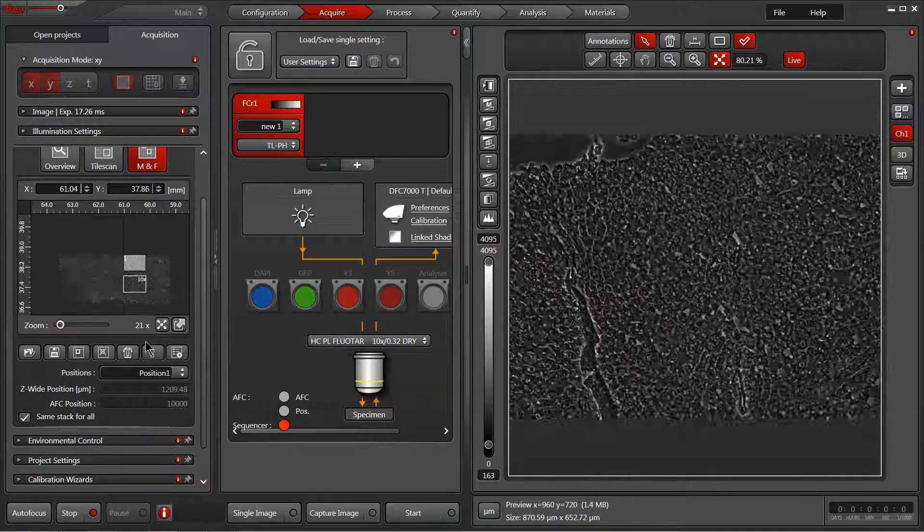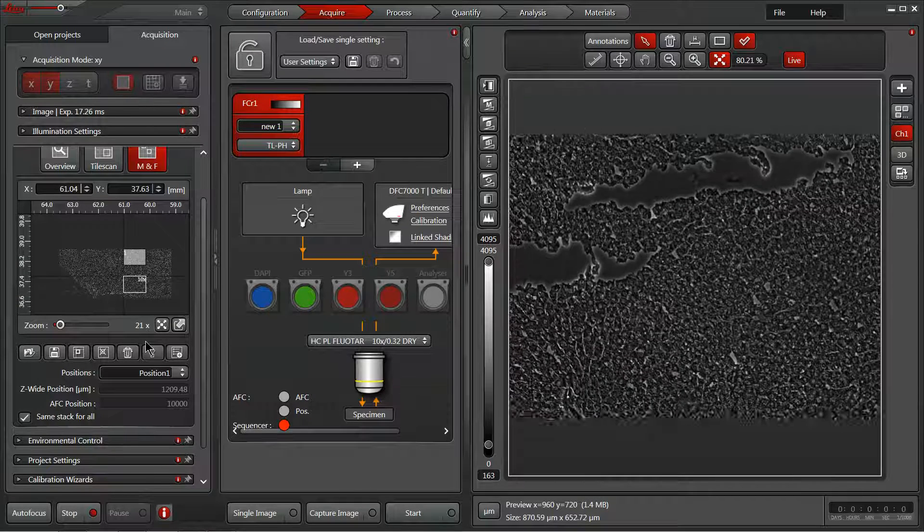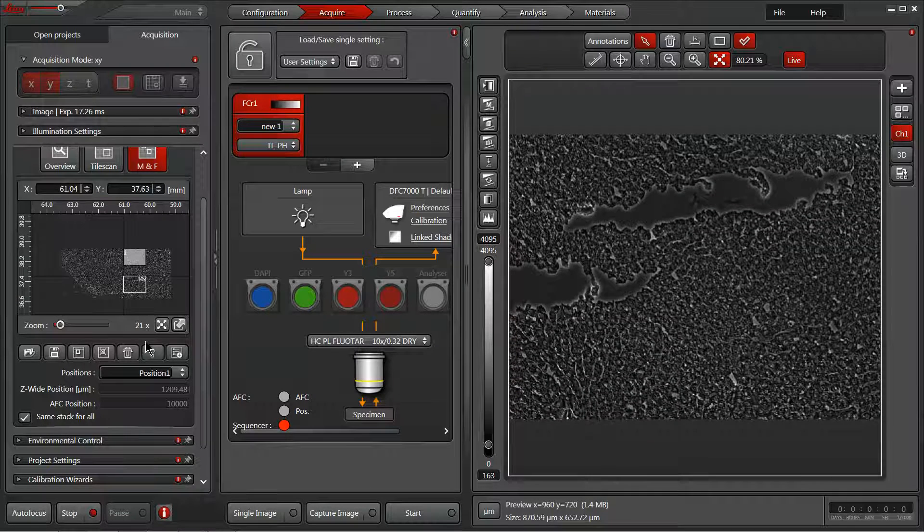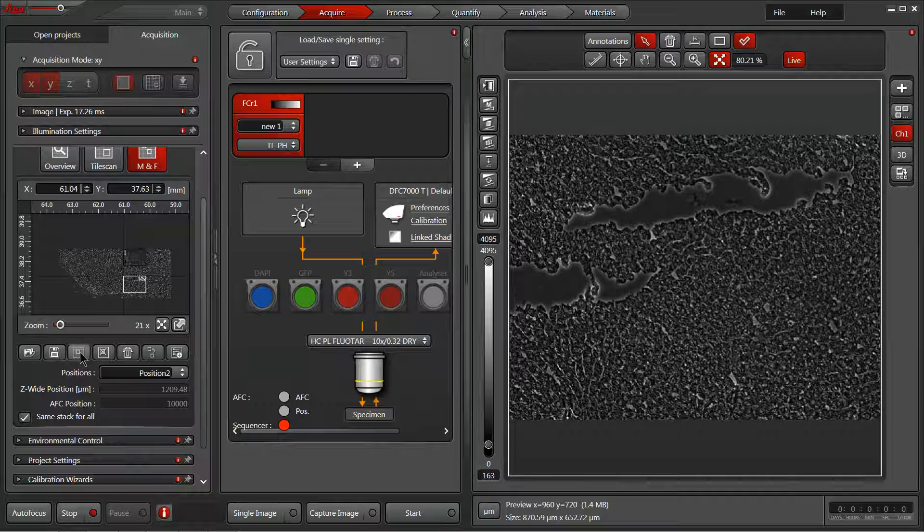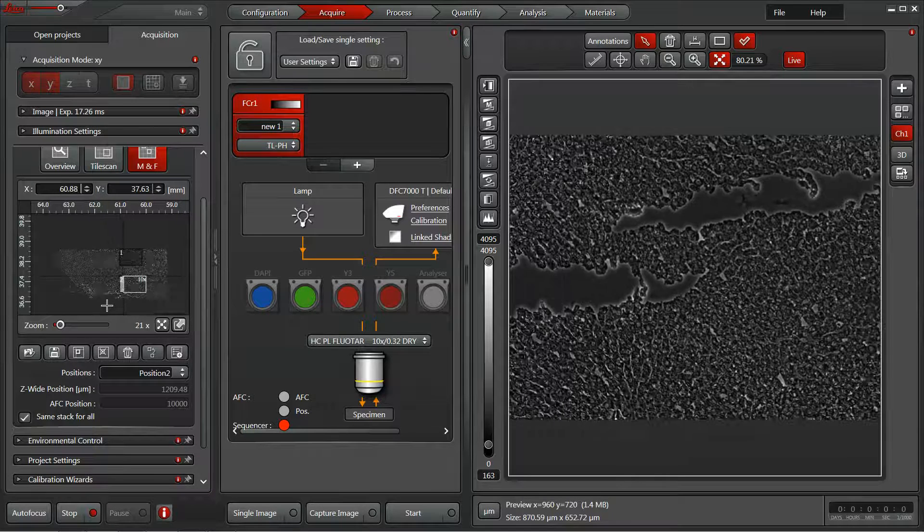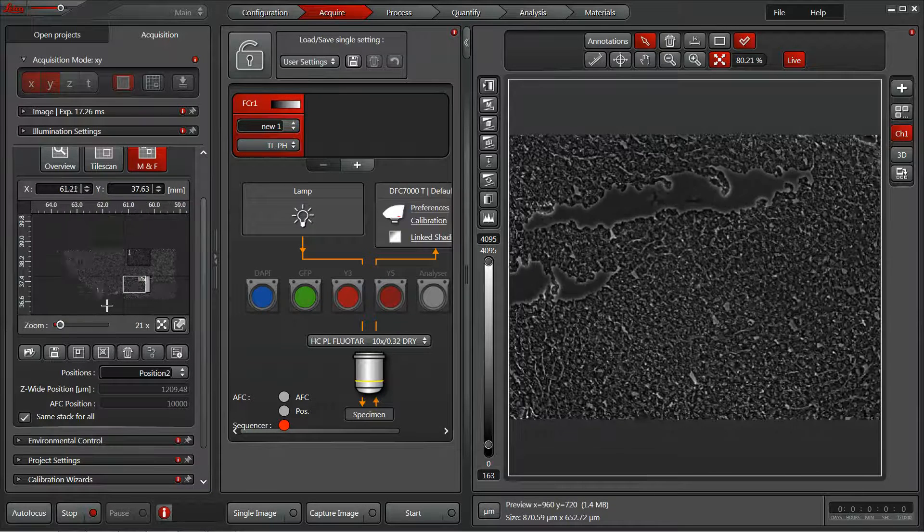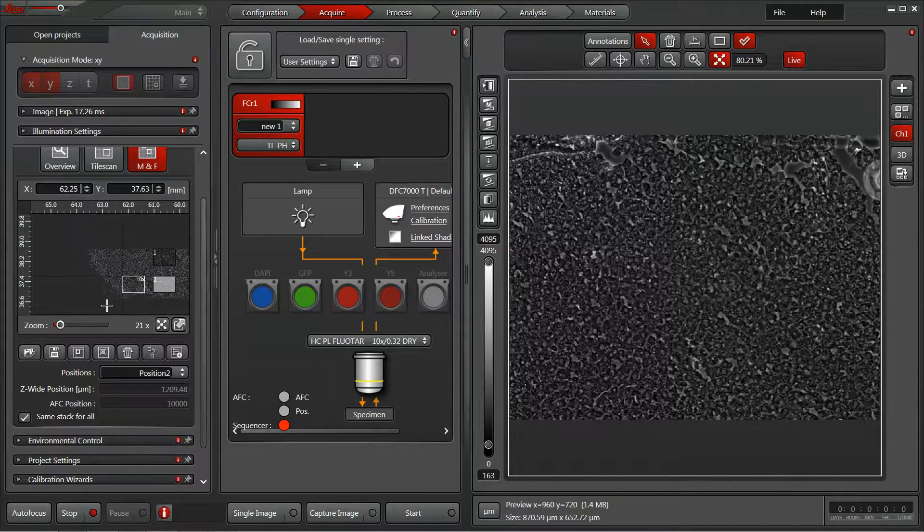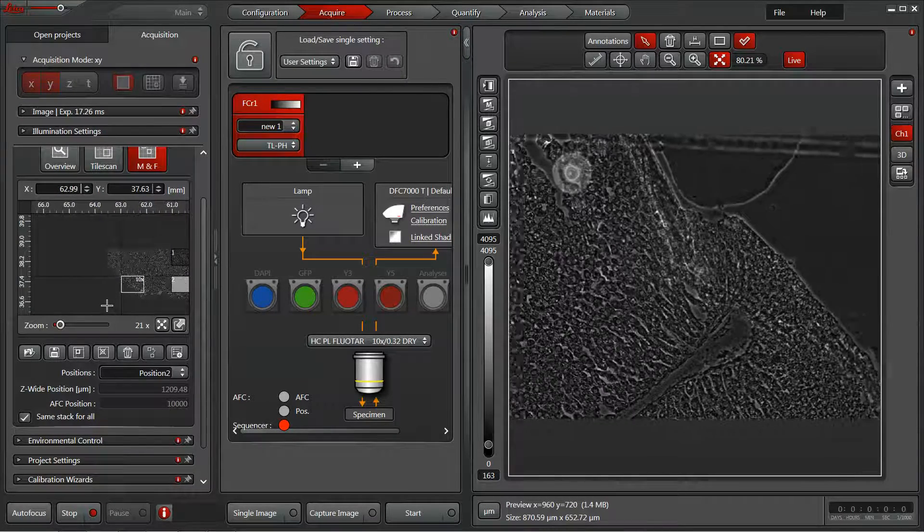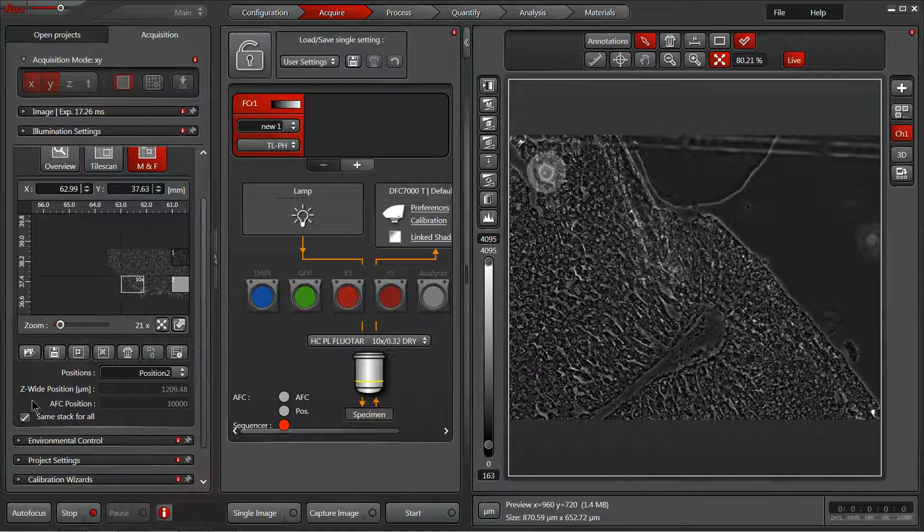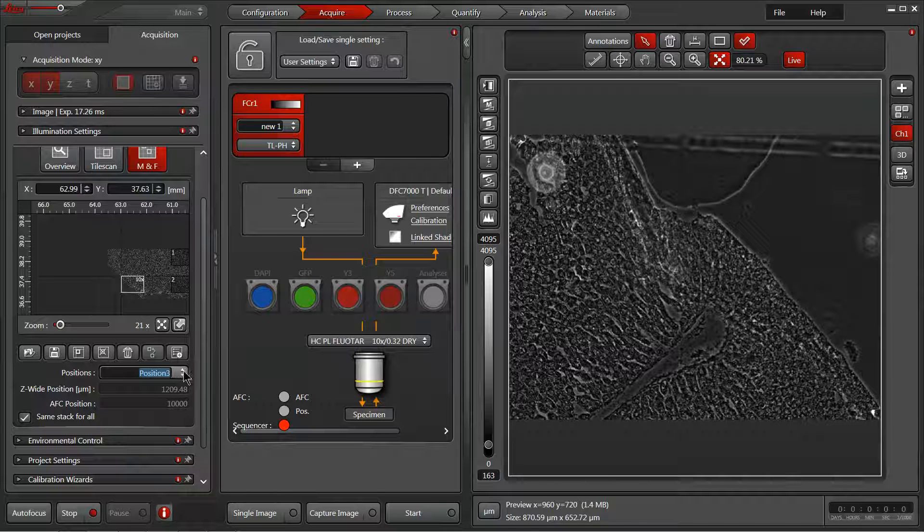Now we can move to additional areas that we'd like to capture. Unless you want to stitch it all together, these will exist as individual images that can be quite separated in space. Excellent. I'm going to mark this position. So now we've got a list of three positions here in our dropdown menu.